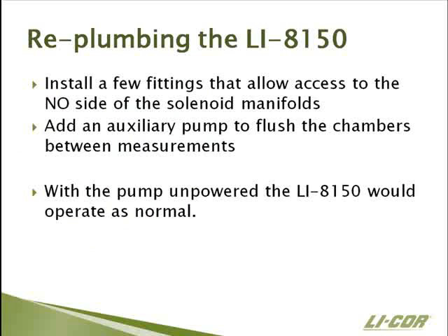So once we've selected a chamber volume that we need to work with for our material, it's time to go and attach those chambers to the system and modify the LI-8150, the multiplexer, to actually make these measurements. The first thing you're going to do is install some plumbing fittings that give you access to the normally open side of the solenoid manifolds. In its factory configuration, when the system leaves LI-COR, these sides in the manifolds are sealed because they're not actually used for anything.